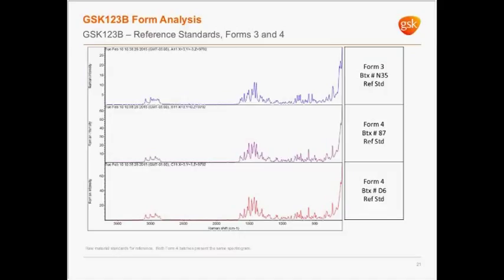The reason for the 2 salt forms is due to the fact that the crystallization process is slightly different between the 2, causing a slight form change, although both of them are actually the same salt. It's important to point out that there are some limitations to the FT-Raman sample preparation at this point. Although I'm able to stop the mixing process and reduce the temperature, it still takes some time to isolate the solids from the liquids in the vials.